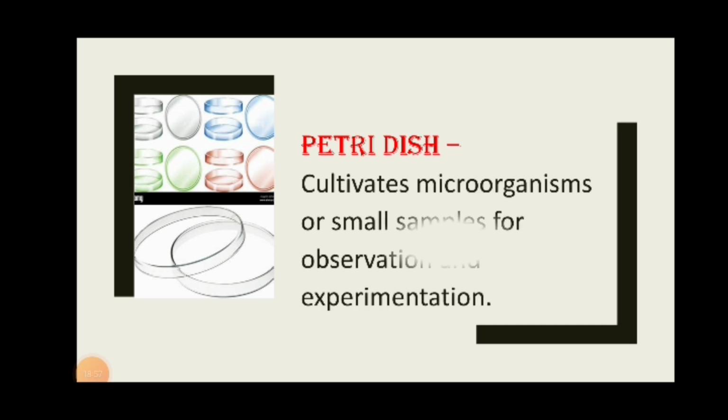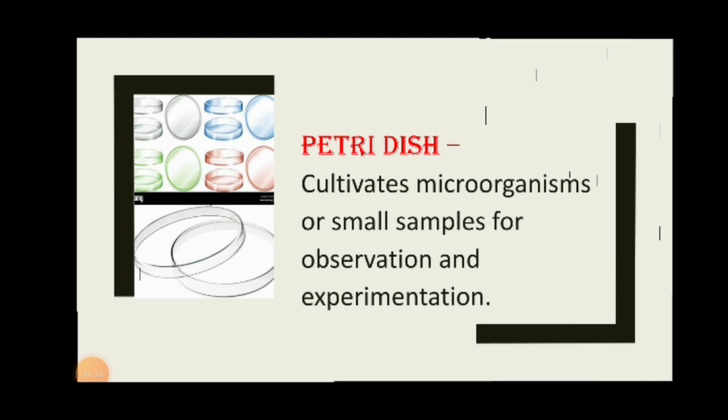Yes, you are correct. This is Petri dish. So, ano ang gamit ng Petri dish? It cultivates microorganisms or small samples for observations and experimentations. You put it inside a Petri dish for other form of a laboratory activity. Usually, ginagamit siya for microorganism na E. coli, Escherichia coli, na yung mga other bacteria you want to, yes, you have to culture, you have to use this commonly sa biology, ang Petri dish.